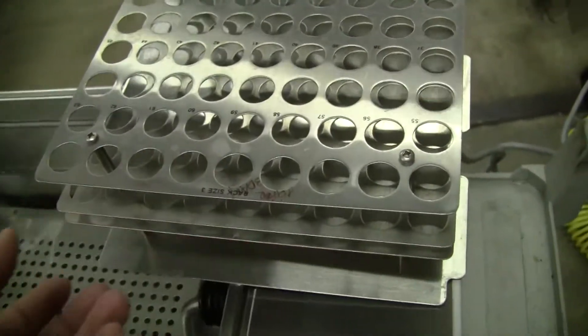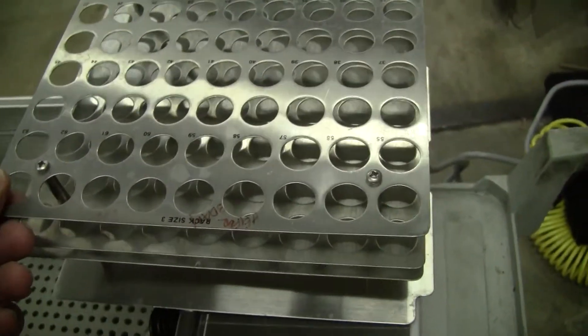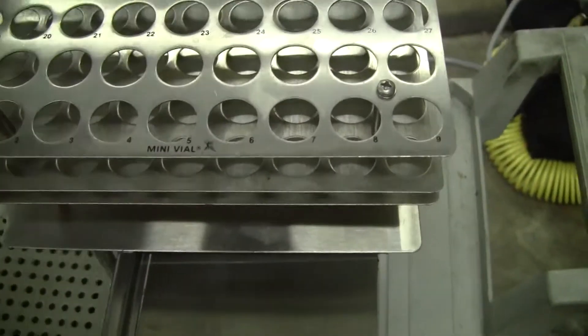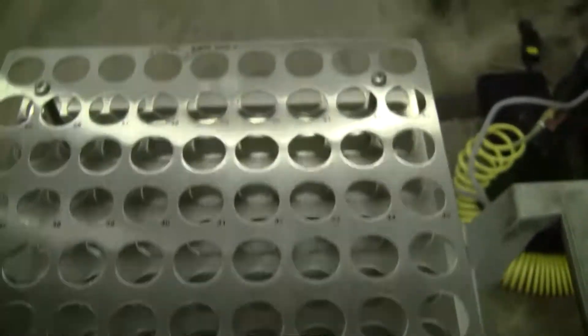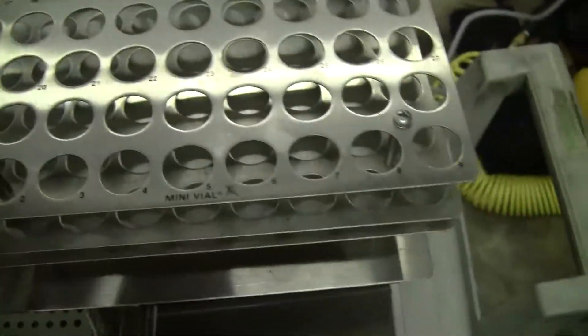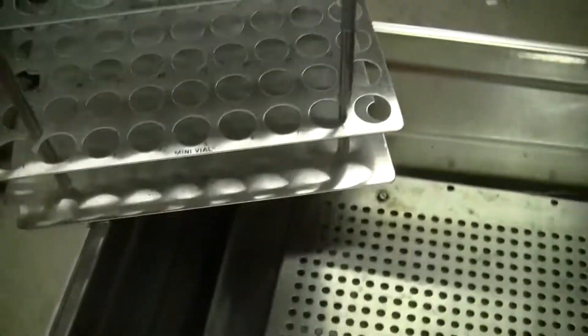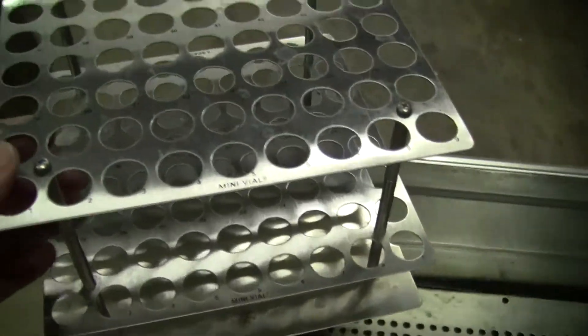These, I don't know if they went with the original unit, but a mini-vial rack, rack size 3. Different size rack. Different in height.